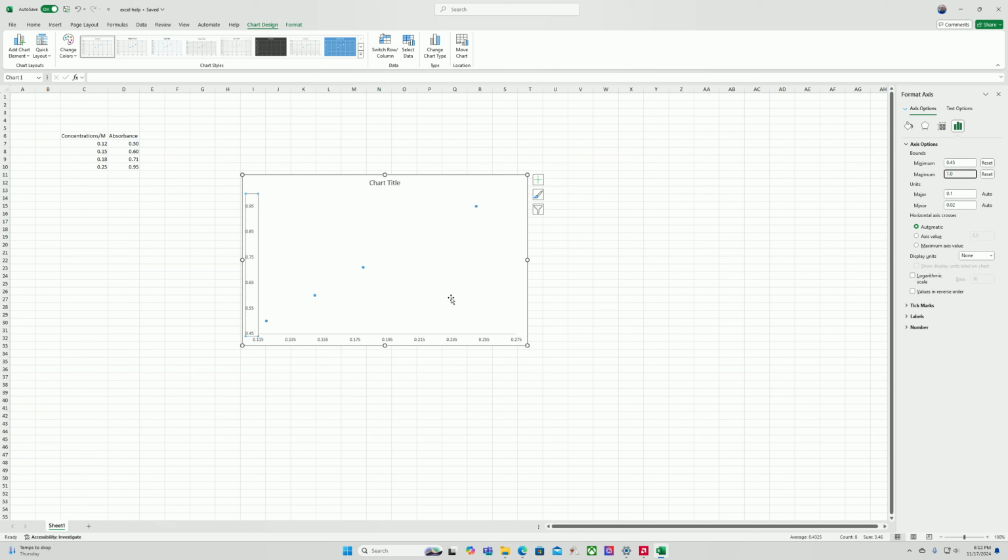Okay, so that looks like a really good graph. It'd be hard for me to take off points for there being too much dead space on the graph relative to the actual data range that you're analyzing. So what we're going to do at this point is, a lot of times we have to do a linear analysis. So we're going to do that linear analysis, and then we're also going to format the graph correctly.